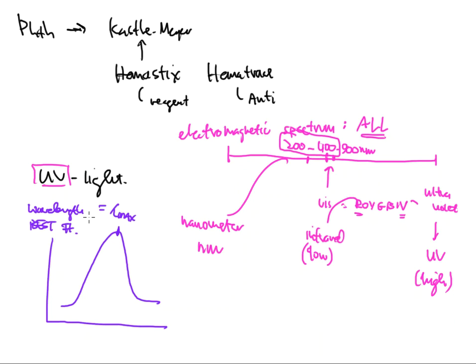Now, that's not the only number, okay? So if I'm making a sample in a lab, or if I have to analyze a sample in the lab, lambda max is going to be the most sensitive area for that compound. But look, it's got absorbance here, and it's got here, and it has absorbance there, and there, and there, and there, and there. And it also has absorbances here on this side. They're just not as much, but there's still absorbances that are assigned to that compound.